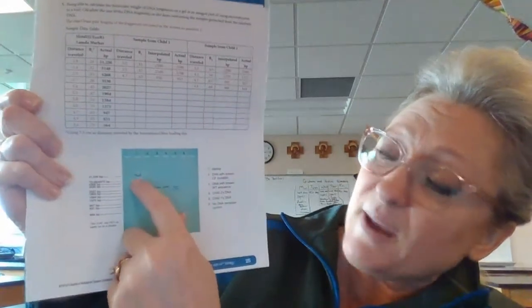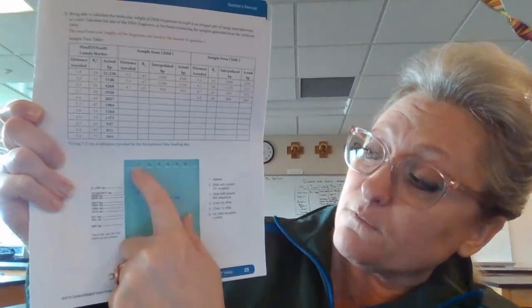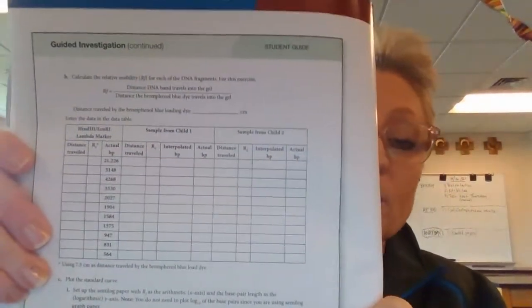Okay, so how far did this band go from here to here? How far did this band go from here, the well, to here? How far did this band go from here to here? How far did that one go? And that's the distance traveled. So we were going to fill in then this chart on this page right here of your lab manual. And in this first column, we want the distance traveled. So that's where we put our distance in centimeters.